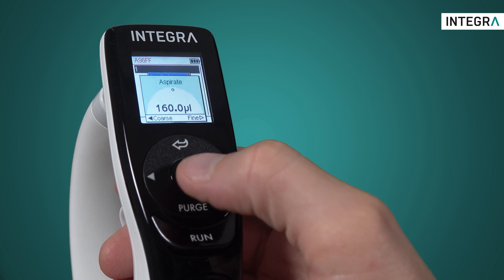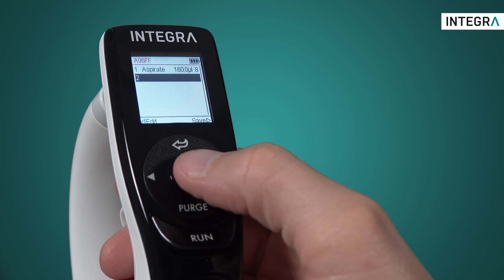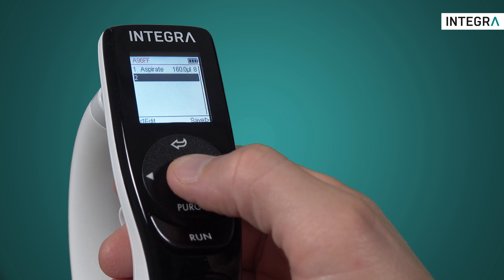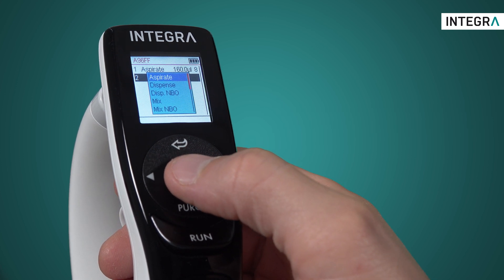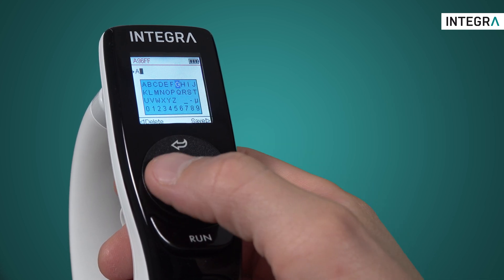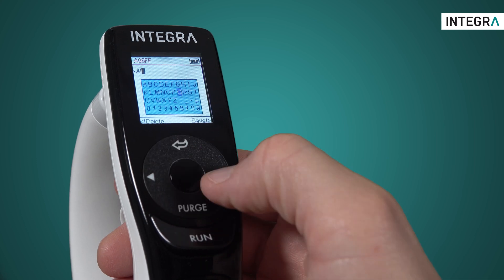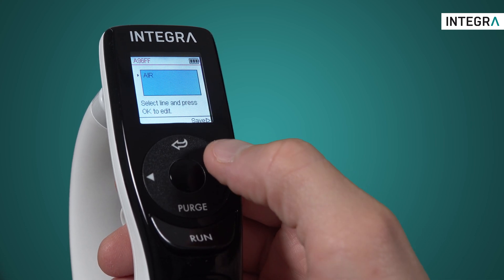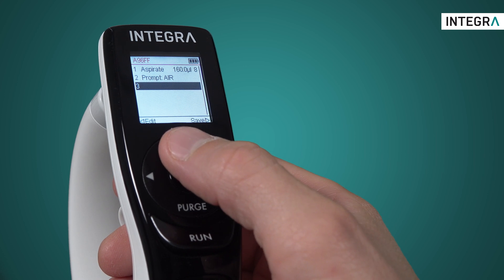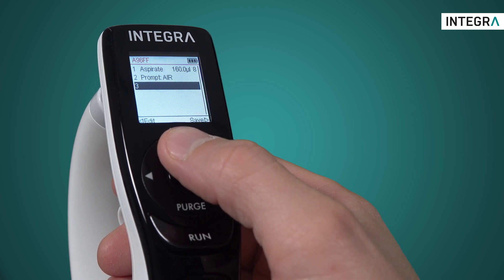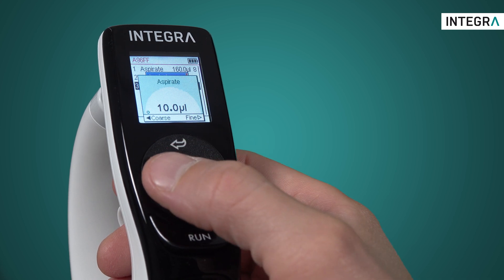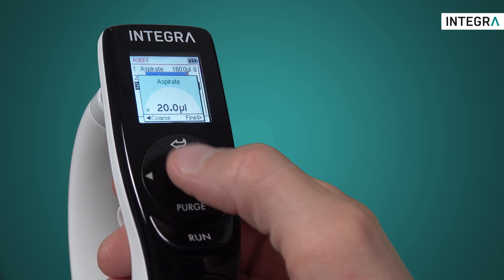Aspirate 160 — so this is the diluent. I want to aspirate my sample into this tip as well, but first let's put an air gap to separate the two liquids. I can inform the user by adding a text prompt with the word "air." The air gap ensures that the diluent doesn't accidentally carry over to your sample source when you aspirate. Then we'll program a small amount of air to be aspirated, so aspirate 20.